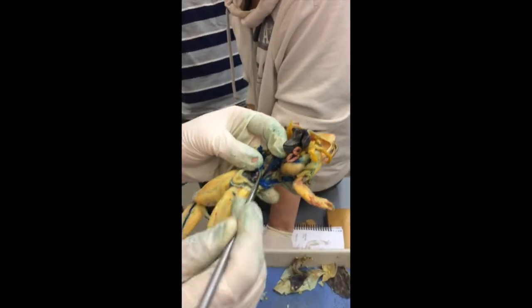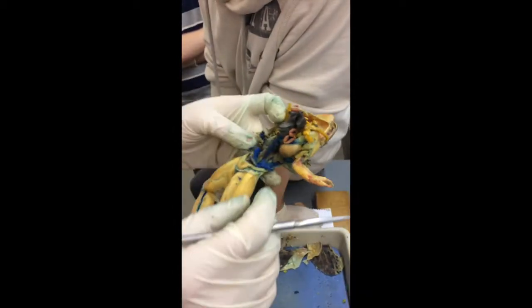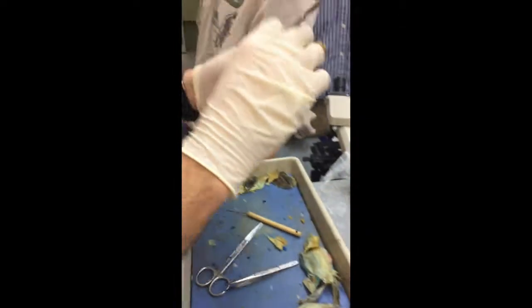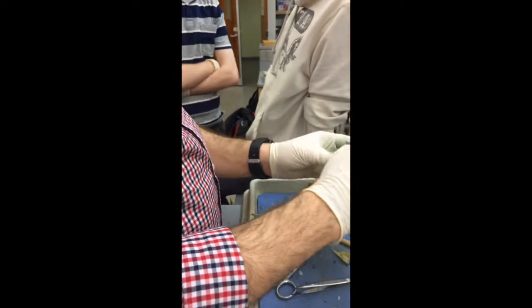Okay, this thing right here is the bladder. Okay, good. Yeah. Okay, what else do I have to show you? I showed you the spleen, pancreas, and kidneys. Okay. It's part of the small intestine.